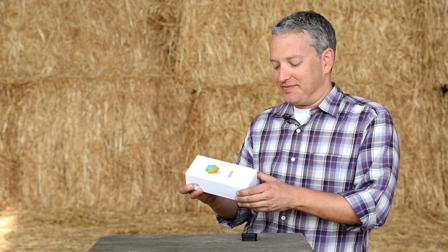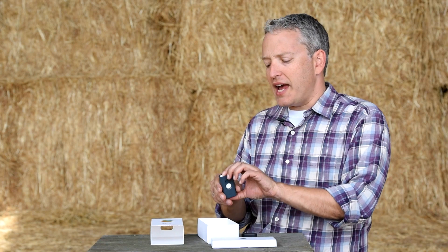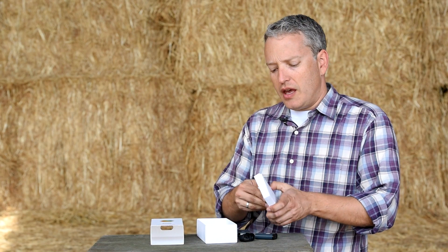So let's unbox Sayo. In the box, you get Sayo, its case, a rubber shade, and the charging cable.